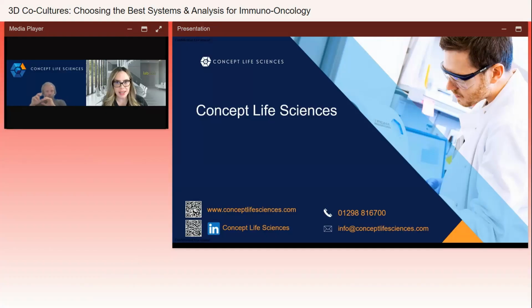Okay, great. The next question that we have here says, how do you maintain functional immune cell activity over extended culture periods in 3D systems? So when we've incorporated macrophages, that's not been an issue. Let's say the system we had there at the end, looking at the liver fibrosis, we've actually done primary macrophages in that as well. We generated the macrophages beforehand by differentiating monocytes with MCSF, collecting them at the end, and then incorporating them directly into the hydrogel with the other cells. Essentially, the support they need seems to be sufficient there. We didn't add any further supplementation, and we've found activity over 3 weeks later just by stimulating. They're the only cells in there that can respond, because if they're not there, then we won't get the response we're looking for.